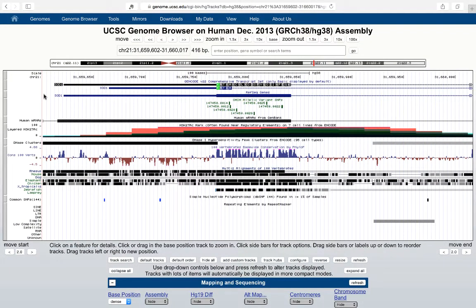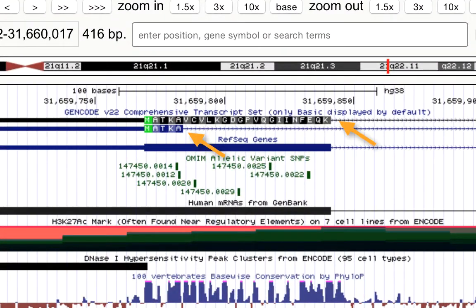In exon 1, you can see the structural difference between the two transcripts that are reported by the GenCode genes track versus the one transcript reported by the RefSeq genes track.